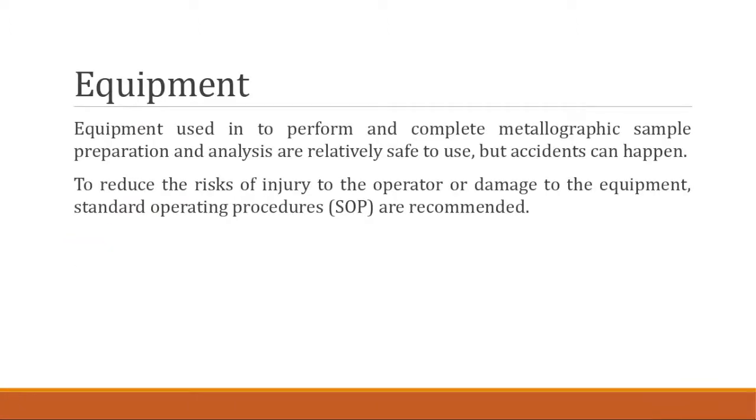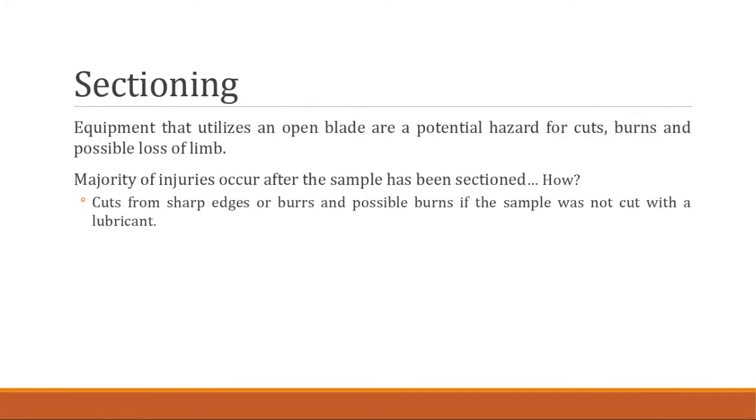When it comes to lab equipment, this is what separates our lab from other laboratories, and it's going to be because of the equipment that we use. All of our equipment in the lab have standard operating procedures for each one. So if you've never used one before, and even after you go through your training, we do have a standard operating procedure, so that way there's a step-by-step process of how these are working.